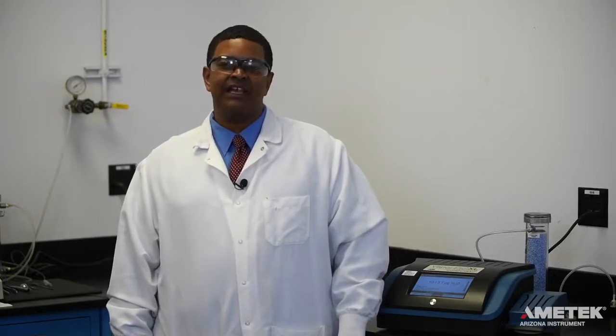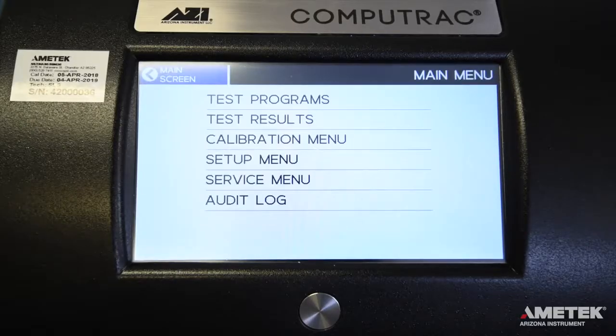In order to check the flow, first verify that the pressure of the carrier gas being supplied to the instrument is between 17 and 22 psi and that the instrument has been powered on for at least 20 minutes with the gas connected. Once those conditions are met, press the menu button on the main screen.